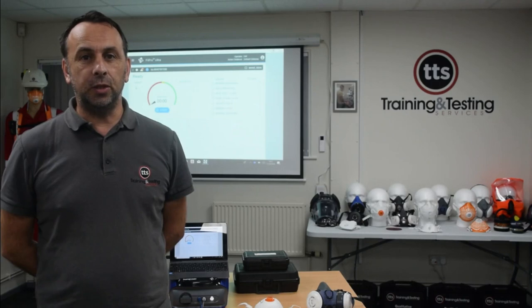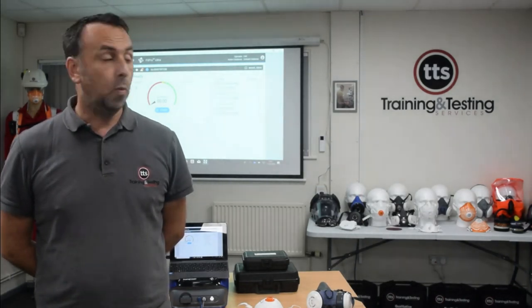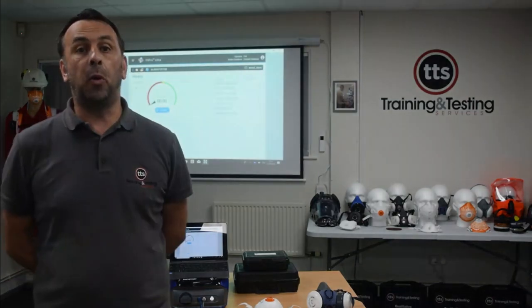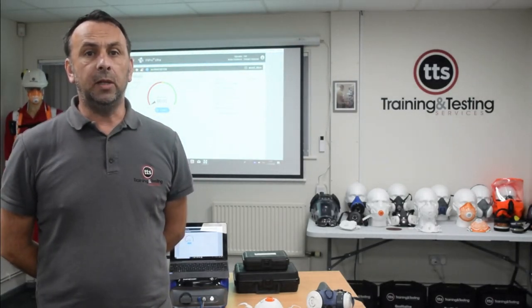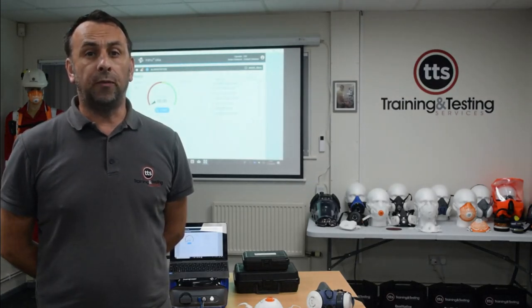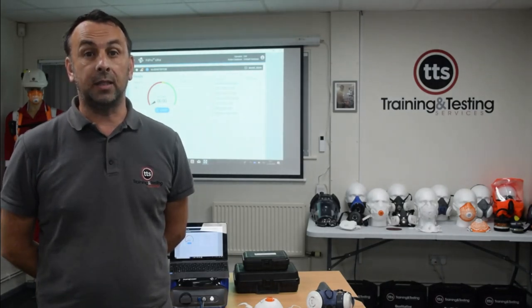So what I'm going to do is carry out 2 face fit tests, using a disposable half mask and a reusable half mask, with the aid of the TSI PortaCount particle counter. Once those tests have been completed, we're going to look at the results and see if they pass or fail. Once we've got a result, I'm going to go away, have a shave, and we're going to repeat the process. Then we will compare the 2 results.